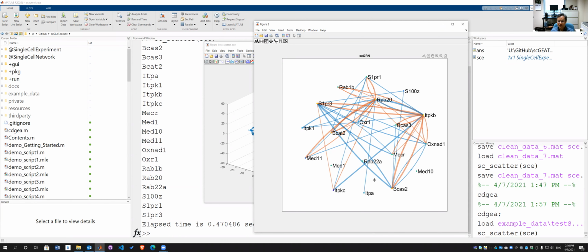So this graph is called directional. It tells you the regulation relationship and who's upstream, who's downstream, and who regulates who. However, a lot of analysis does not require this. You can change this to unidirectional.